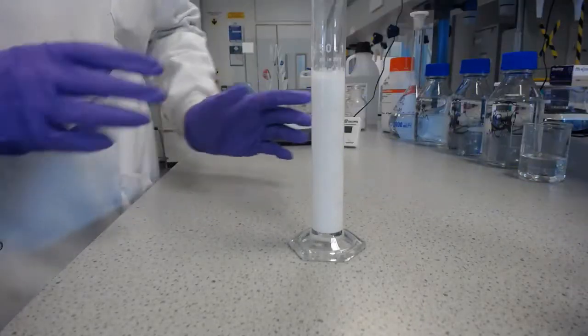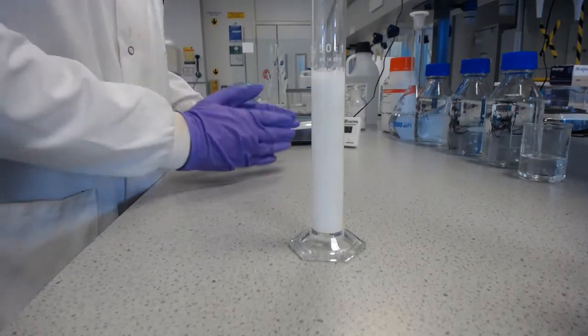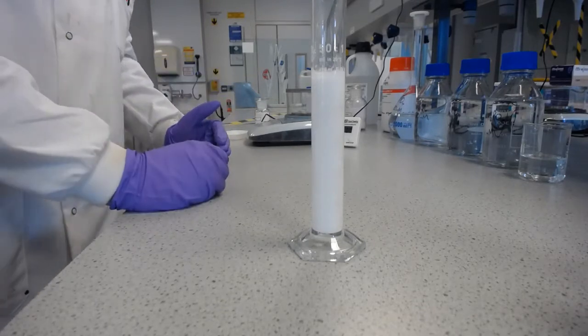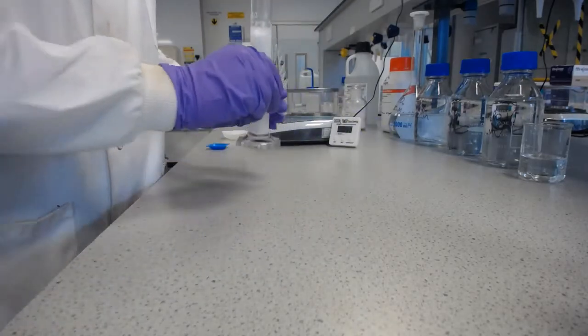So I'll show you the starting point and I'll take pictures and put them into the video so you can see how that sedimentation went on over time between them. And then after we've finished that and recorded the results and done the next part of the lab, we'll then go on to analyse what that means.